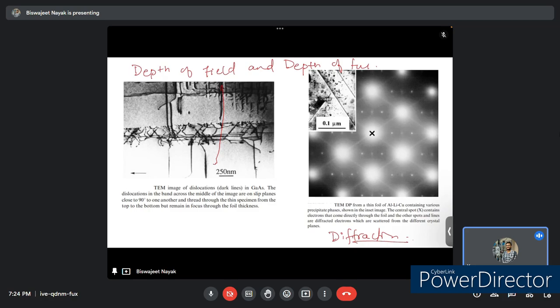As in a crystal, we know the lattice repeats at regular intervals. So it gives information about the specimen shape. And this pattern can also be related to the image of the area of the specimen from where it came. More about diffraction we will encounter in further topics, as we move further we will see this diffraction concept extensively.